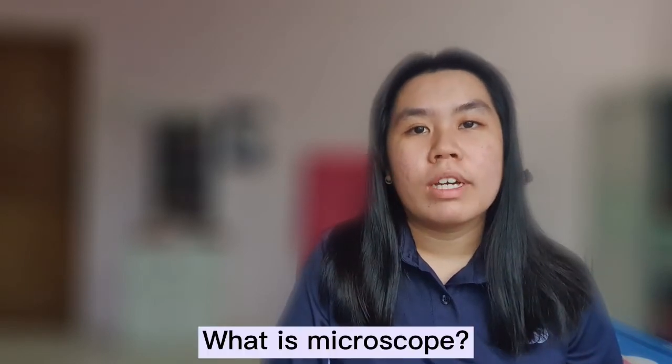Now I'm going to talk about microscope. Before I start my presentation, I'm going to introduce a little bit about microscope. First, what is microscope? Microscope is an instrument used to see objects that are too small to be seen by the naked eye. There are many types of microscopes and they may be grouped in different ways. But for this video presentation, I'm going to talk about a light microscope.